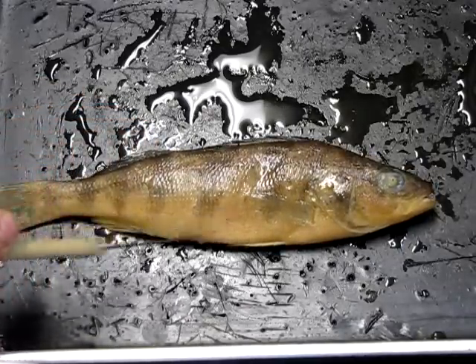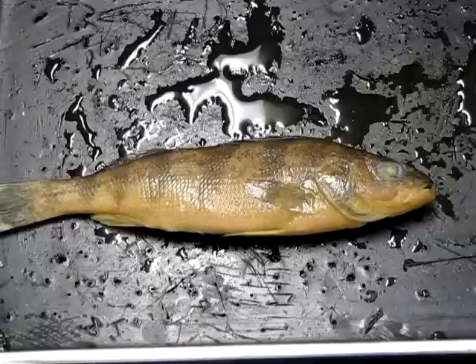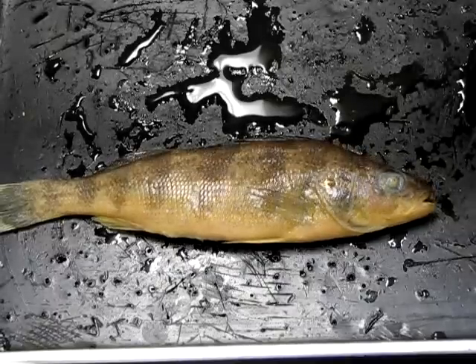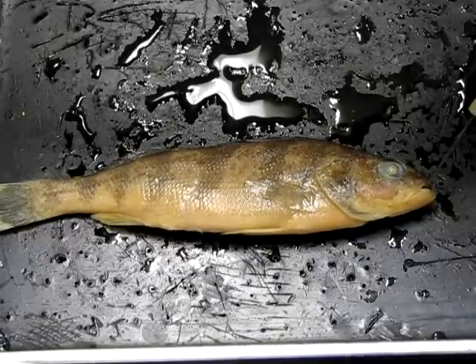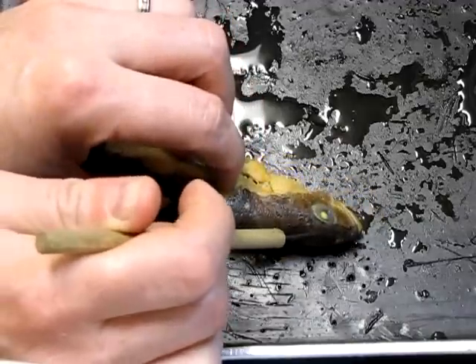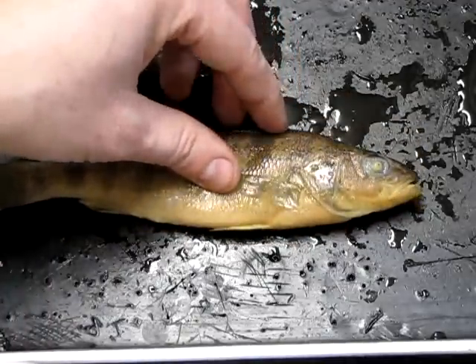Starting with a quick look at the external structures, we begin at the head. We have an eye here, the mouth with its teeth at the front, and a pair of nostrils — one on either side — which have an olfactory, or smelling, function.